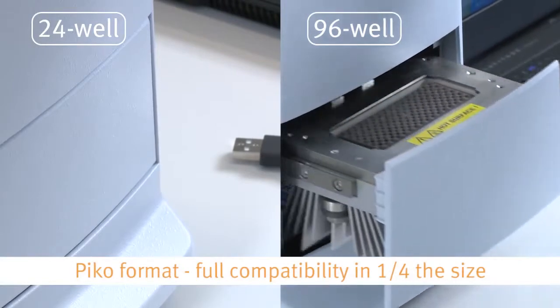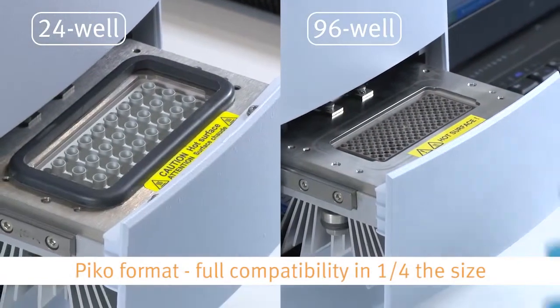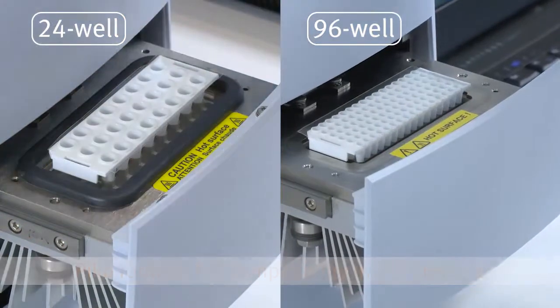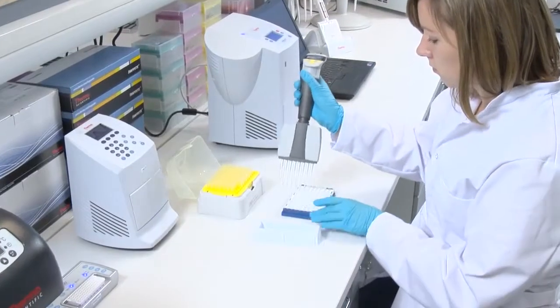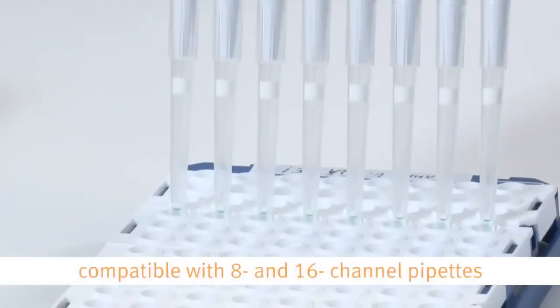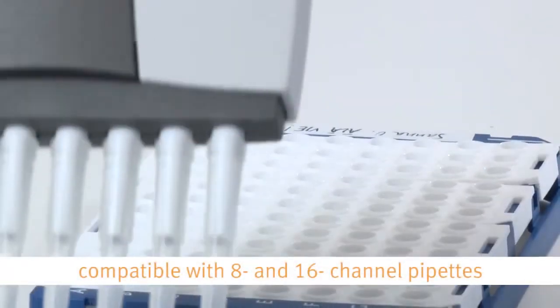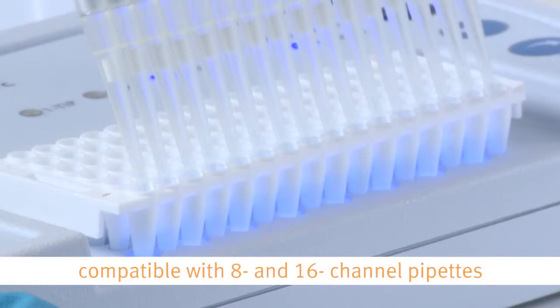The Pico format plates are a quarter of the size of standard ANSI plates. The Pico format follows the industry standard in well volume and well spacing, and thus the Pico PCR plates are compatible with standard multichannel pipettes and liquid handling robots.